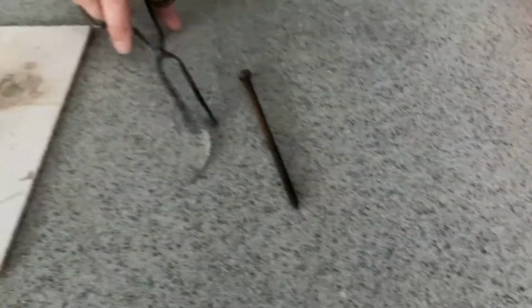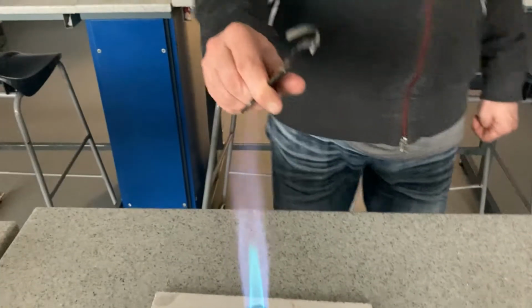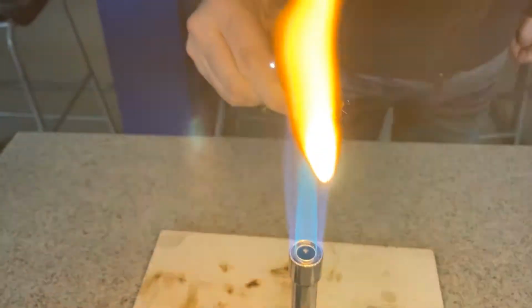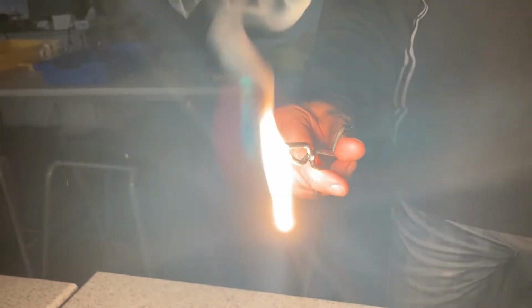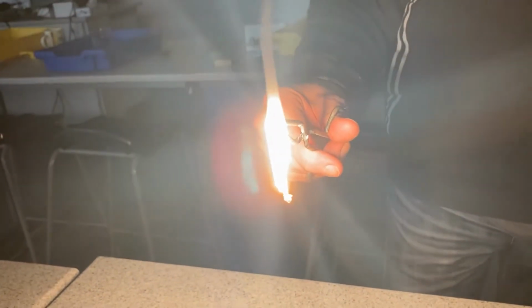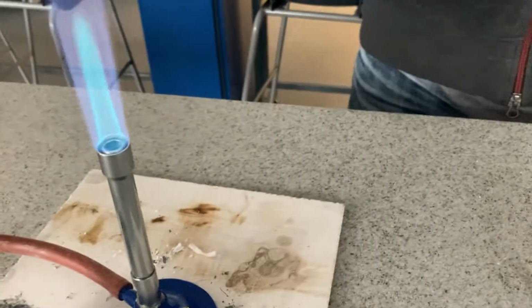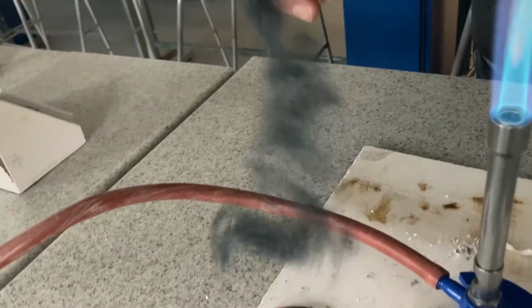Right, let's try this one here. Magnesium. Will that react with air? No, not really. Oh, yes! What? Oh, my eye! I can't actually see. I've got a green spot in front of my eyes. I can't see. Oh, there we go. Done. Finished. So you can see, magnesium is definitely very reactive. Iron and copper less so. If you want to get iron to go, classic example, increase the surface area, makes reactions go better.